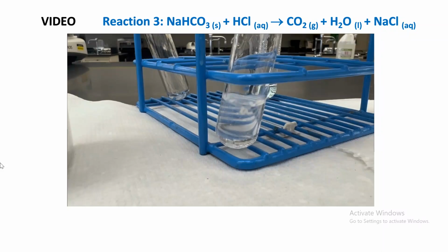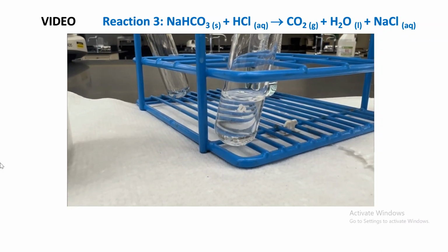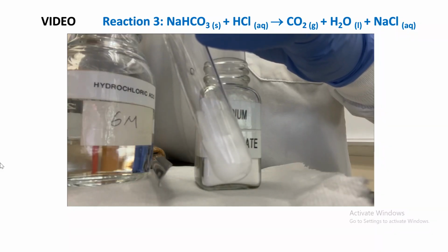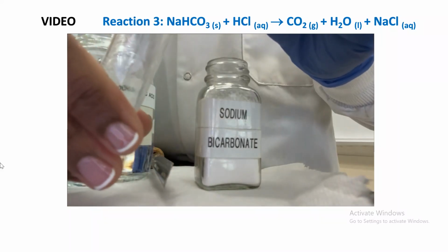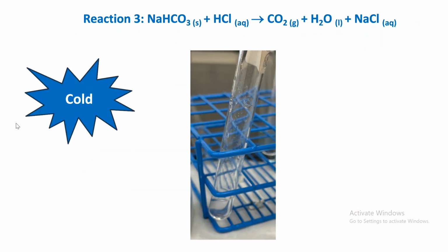And the reason, oh yeah, and that didn't even have time, the sodium didn't have a chance. It reacted immediately. You see? It reacted right away, because we have a very strong acid, 6 molar. So is it hot or is it cold? It is actually very cold. Believe it or not, it's very cold.